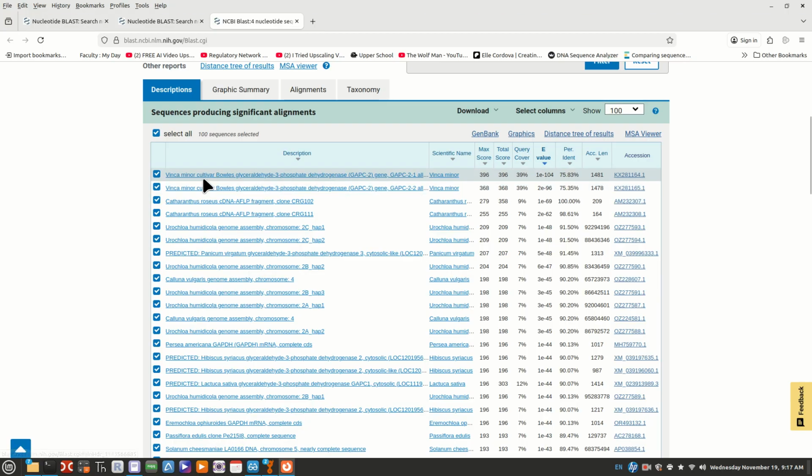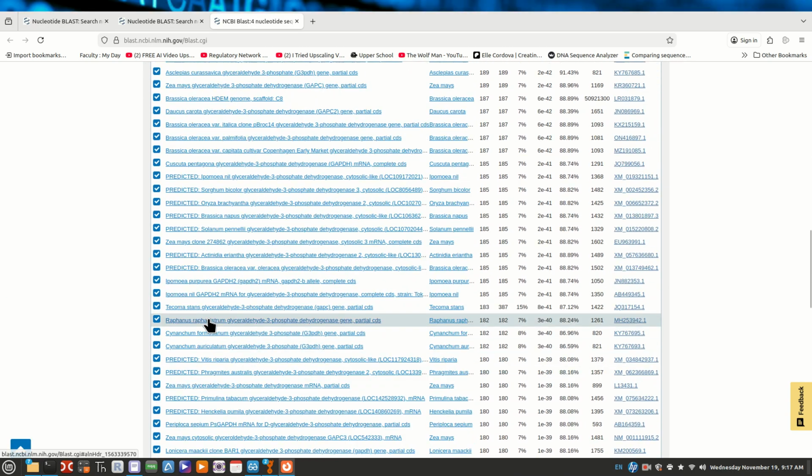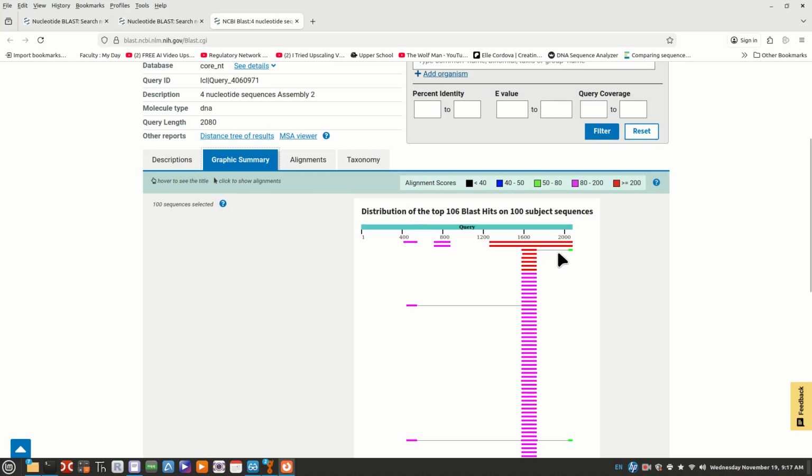Alright, I don't know exactly what we're expecting, but these are the things out there that are known that are similar to the sequence that we just sequenced. Alright, and how similar are they? Well, they're very similar towards around 1600. Alright, some around 400 and 800.